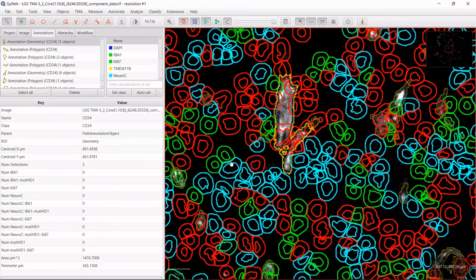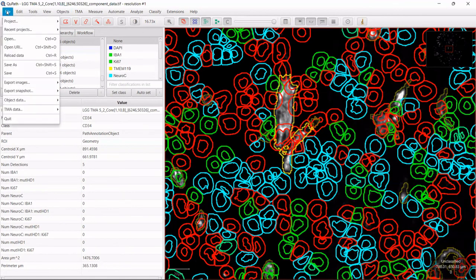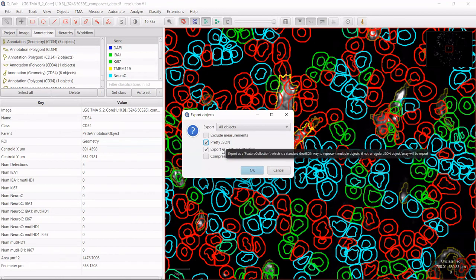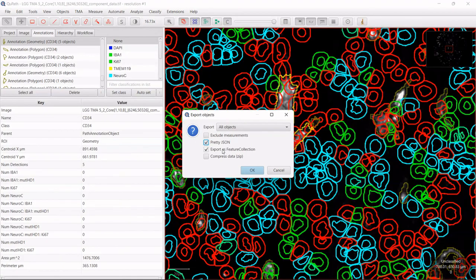You can export the outlines of the cells and annotations. Under File > Object Data Export, export as JSON. You can click Pretty JSON — a JSON format that can be easily opened in other software. Especially if you collaborate with a bio-image analyst, this is a good format for them to continue analyzing your data.